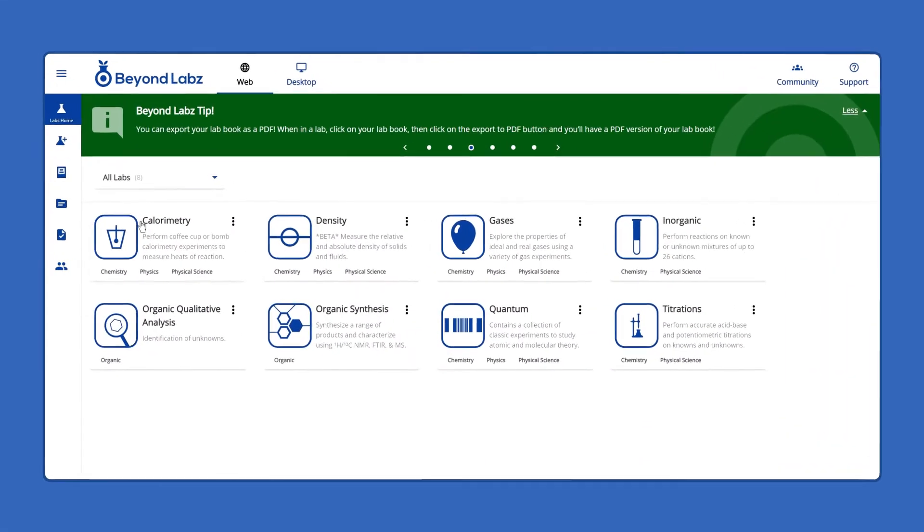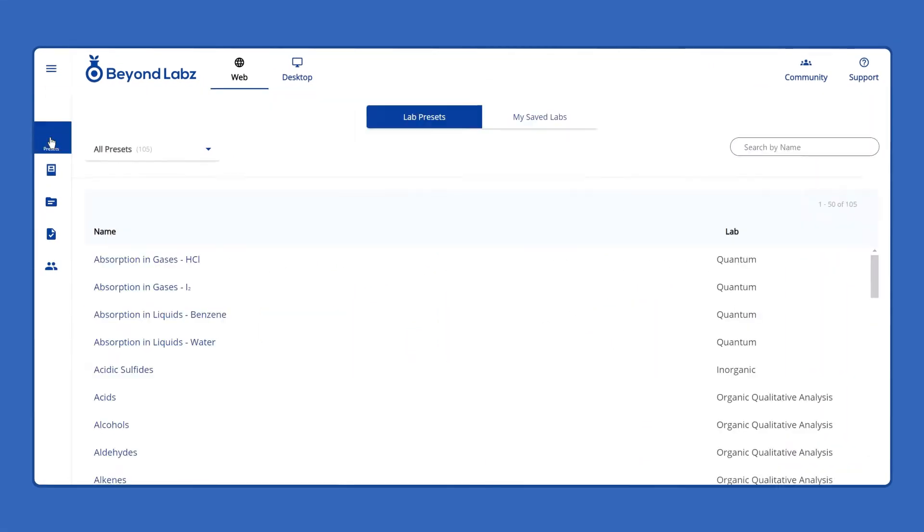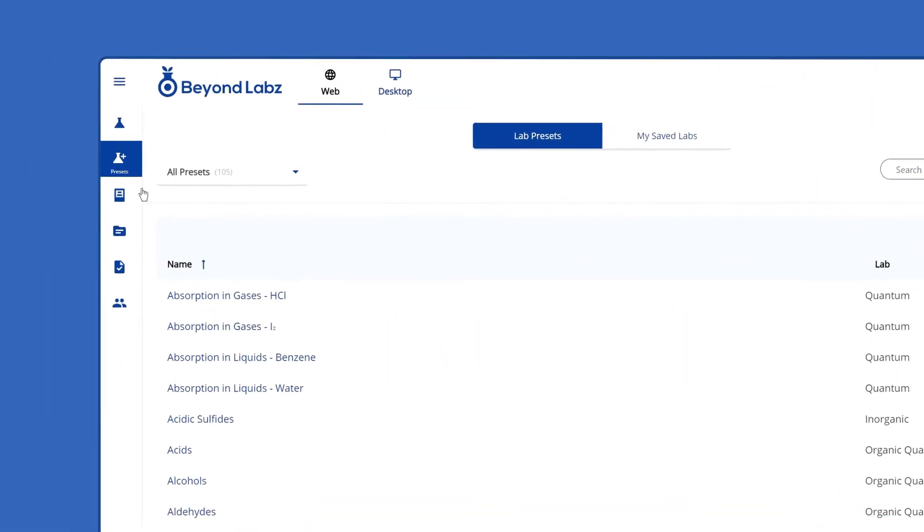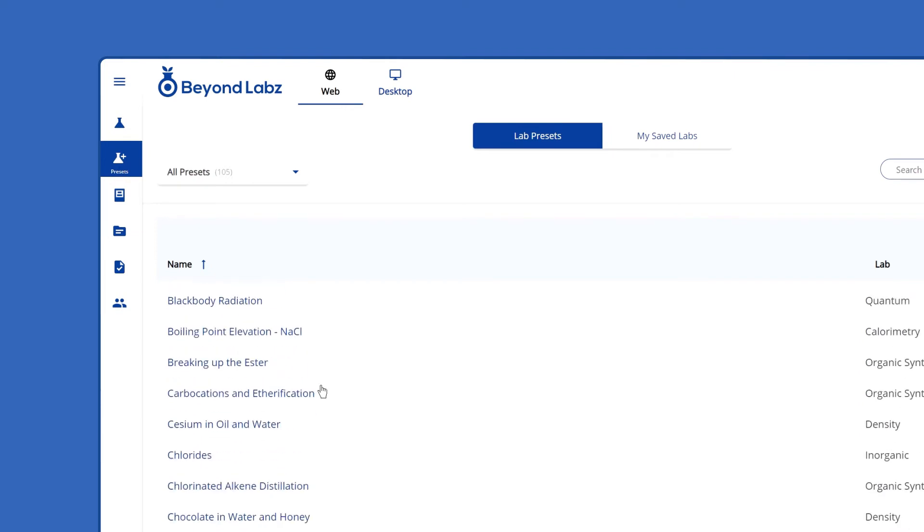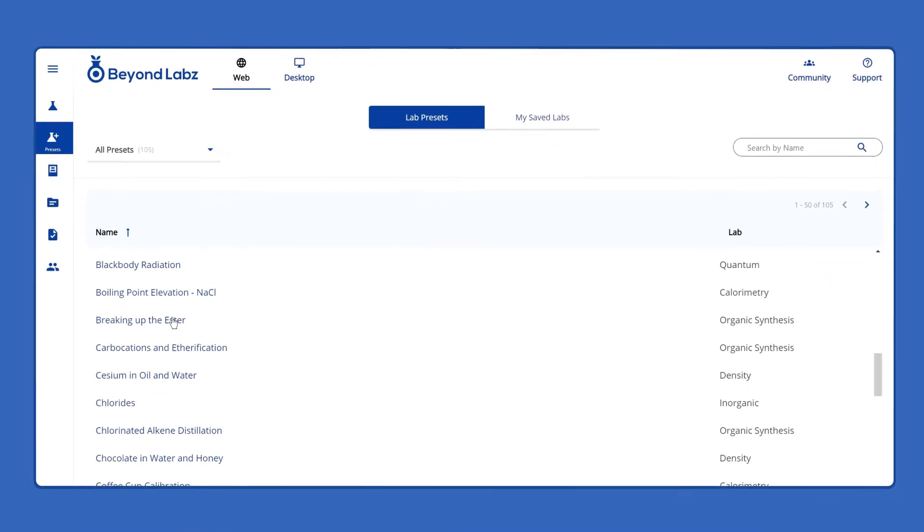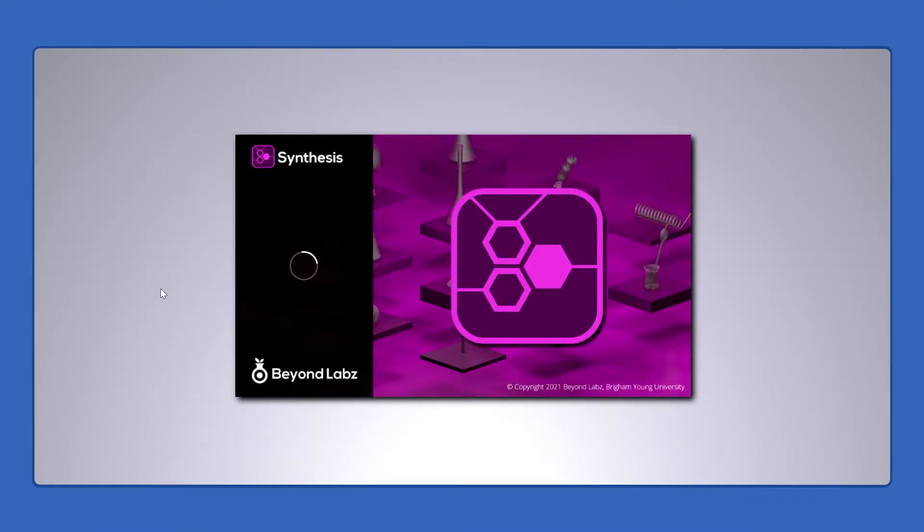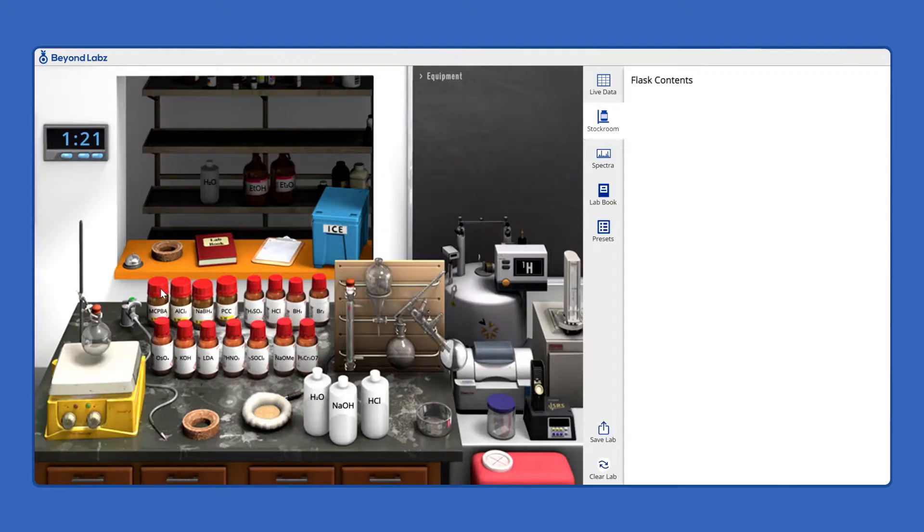BeyondLabs offers hundreds of lab presets covering nearly all core curriculum topics. Simply click on the experiment to launch a lab setup with all the necessary equipment.